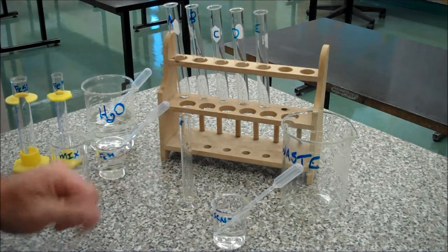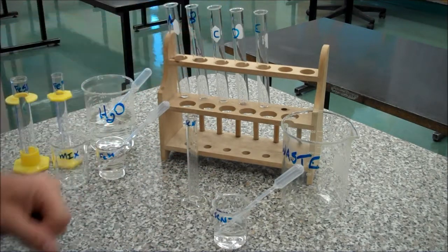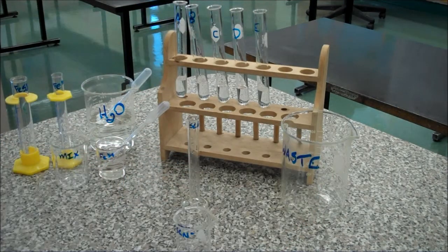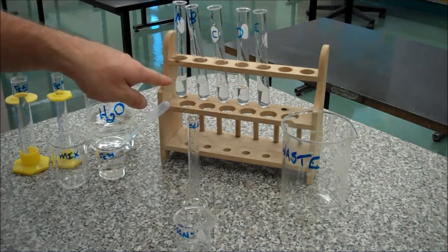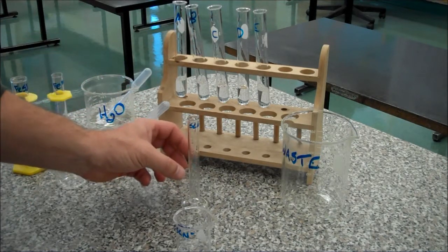So I want 5ml of potassium thiocyanate in each of my test tubes. Okay, so that's all the test tubes with their 5ml. They should be approximately the same level — not perfect maybe, but approximately the same level — indicating that there's the same amount in each.